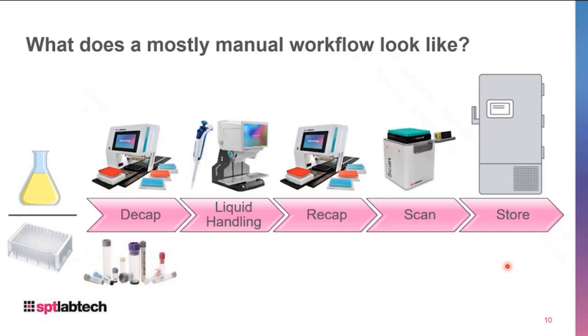In this case, again, manual is the example. Manual freezing is very common and really is a bigger hurdle to jump into, or I guess out of would probably be the right way to put it, but it can be a real nice complement to a very manual process, adding little bits of kit overall.